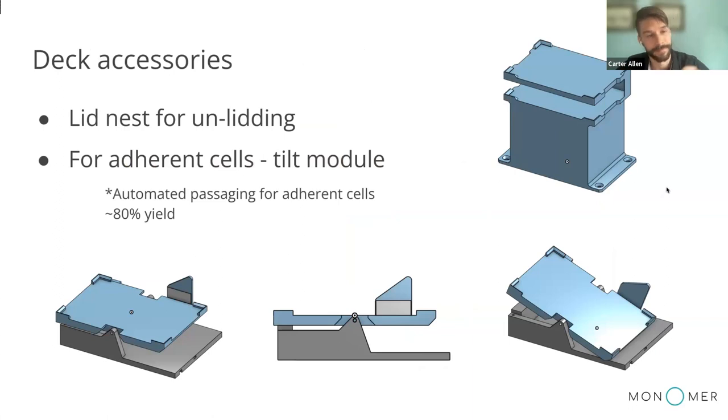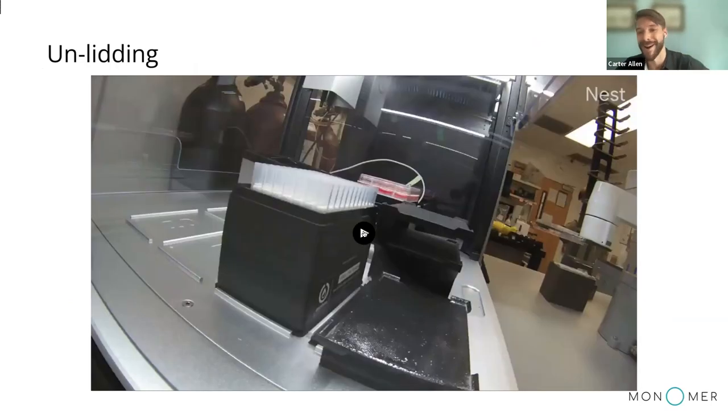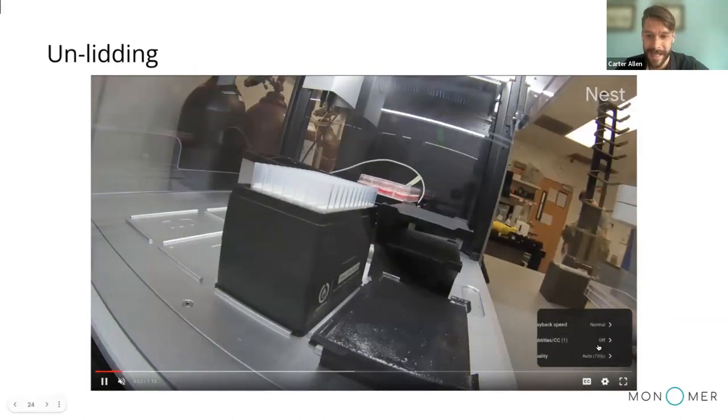All right, to drill deeper into the deck accessories, you can use a lid nest, which you'll see in a bit, for unlidding and lidding. And then for adherent cells, that tilt module. So this is just some CAD that, again, we're happy to share with anybody that's interested. And you saw the Opentrons depressing and tilting the plate and untilting it previously.